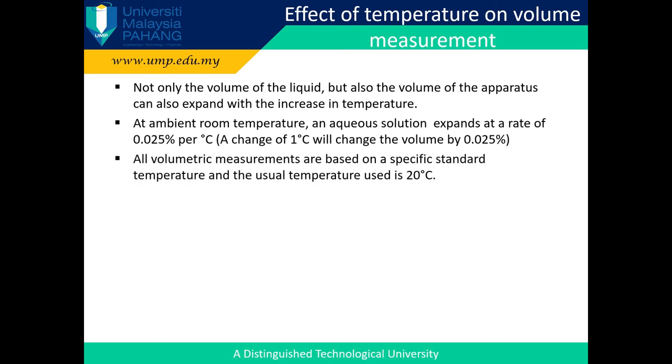All volumetric measurements are based on a specific standard temperature, and the usual temperature used is 20 degrees Celsius. The volume at 20 degrees Celsius can be calculated from the following equation.